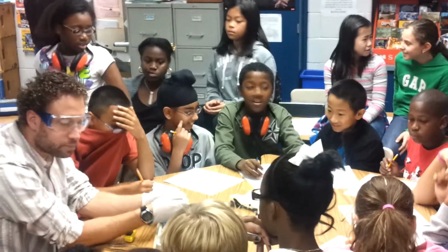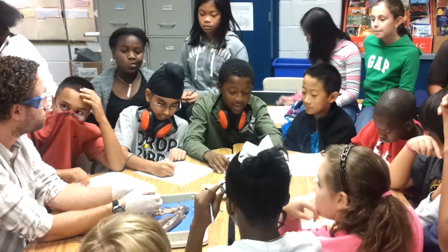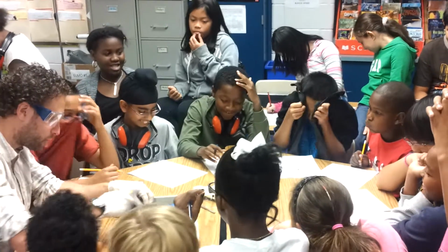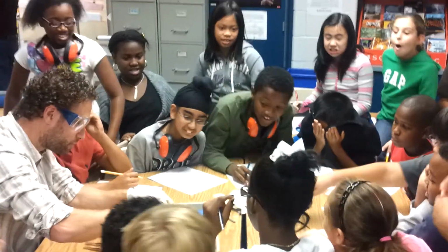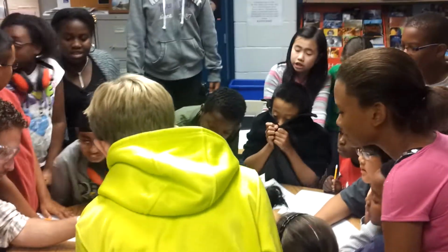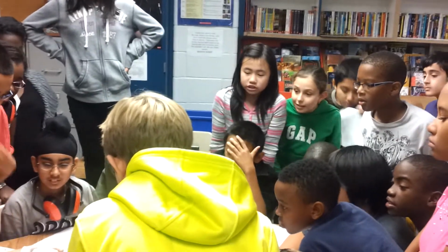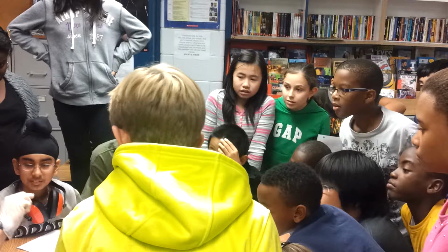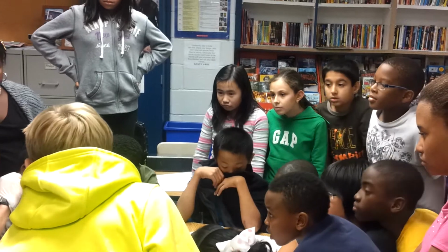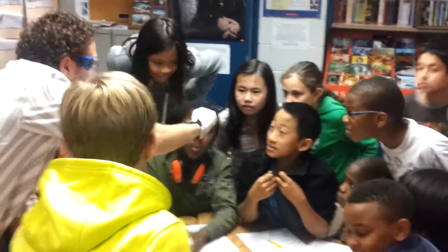Excellent. Okay. Step number 4. Go ahead. Pick some teeth off of the suckers. Use the tweezers to pull them off. It is okay to touch them. Is it hard teeth? Oh my god, it looks like teeth. If you look closely at this ring, this was around the edge of the suction cup, and you'll see little tiny sharp teeth. That's the teeth.